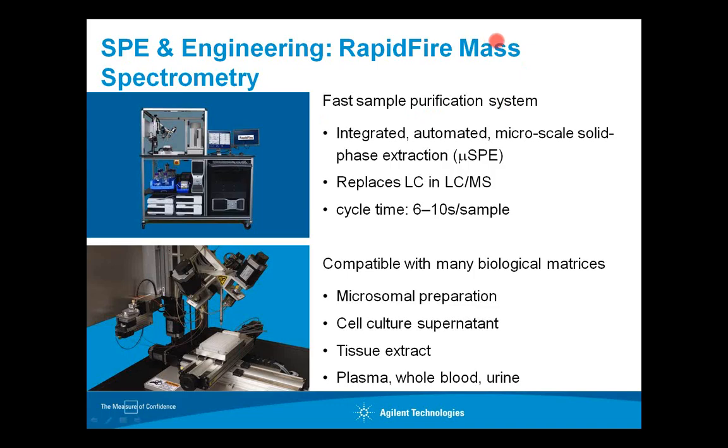But what I want to talk about today is another strategy, which is using, rather than liquid chromatography, SPE, or solid phase extraction, with a combination of excellent engineering, and that is the RapidFire mass spectrometry system I'm going to talk about today. So RapidFire is an extremely fast purification system composed of integrated microscale extraction.